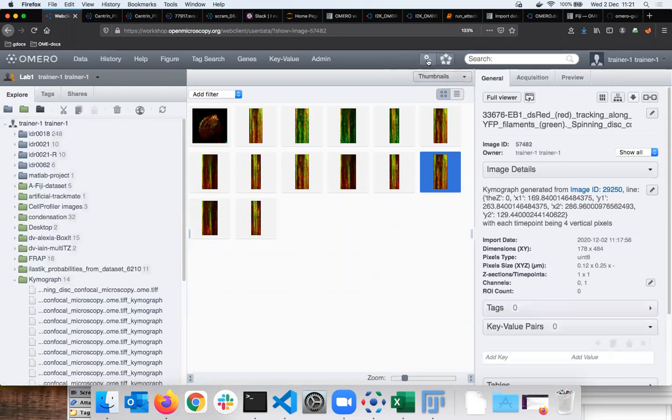And now I can do some Kymograph analysis with a follow-up script. Okay, so I have again analysis, Kymograph analysis. Very good. And then I have to draw a line, if I would have drawn a line according to the other analysis, then I would have some CSV results, which I can study later. Great. So Kymograph, let's leave that aside. Maybe you are not interested in Kymograph. I've never done it myself in my wet lab career. So let's not hammer that down too much.